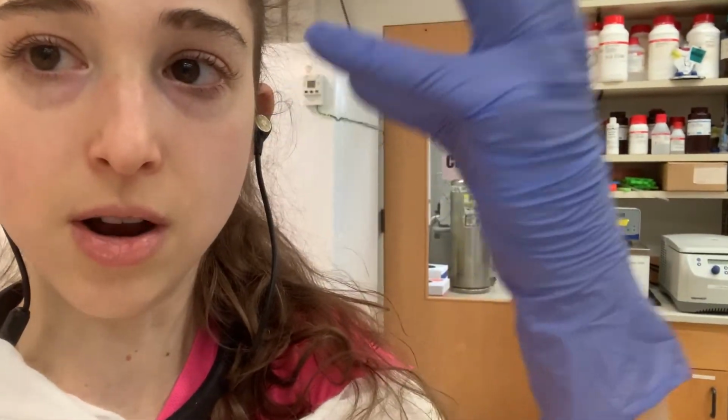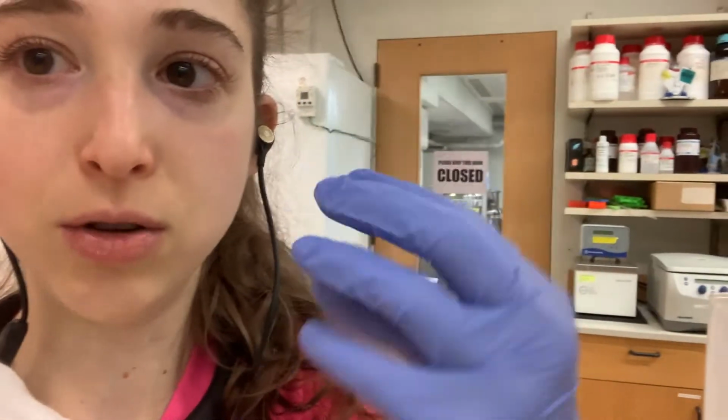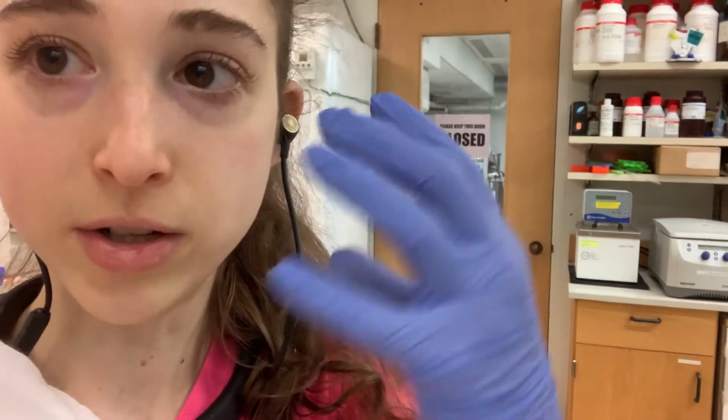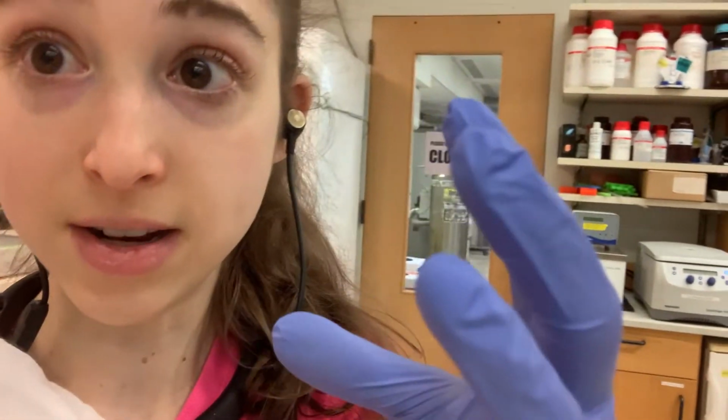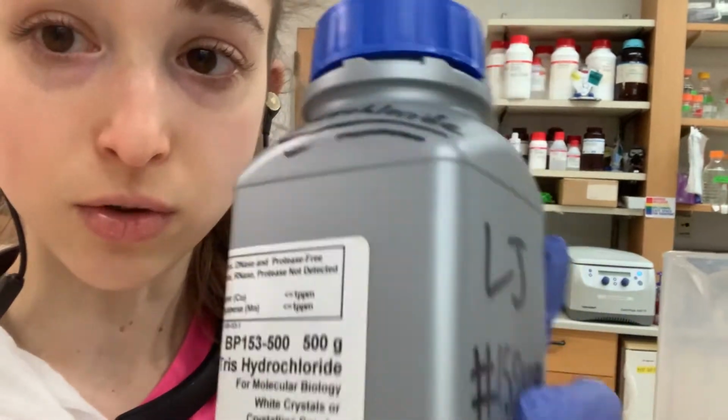So you can see that when you have the acid form, you're coming in with the HCl, so the same amount of tris, molecule-wise, is going to weigh more because it's coming in with all that other stuff. You need to be careful, when calculating how much you need to add for a certain molarity, to take into account the actual molecular weight of the form that you're adding.